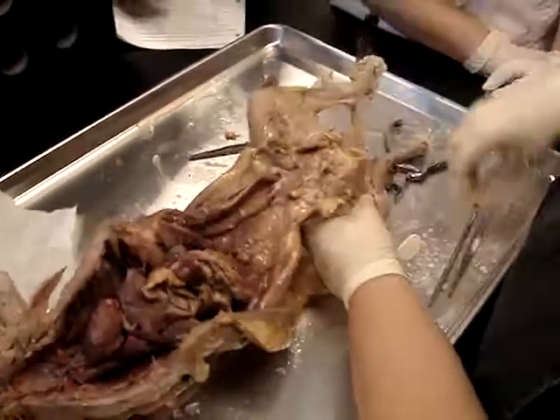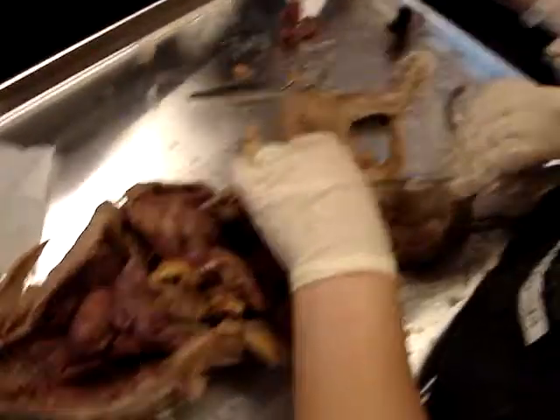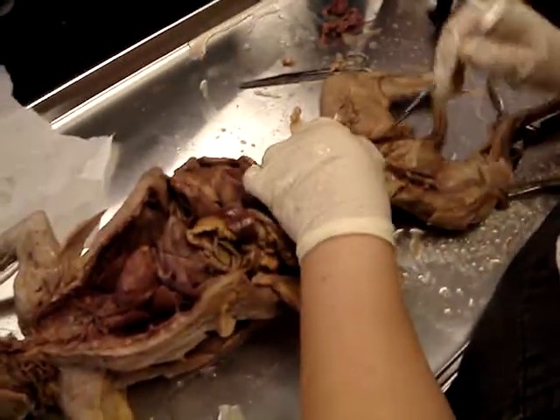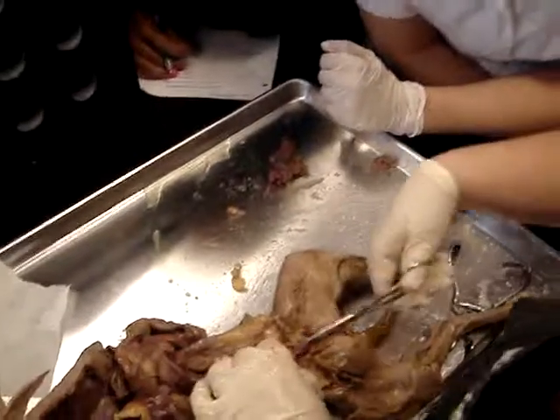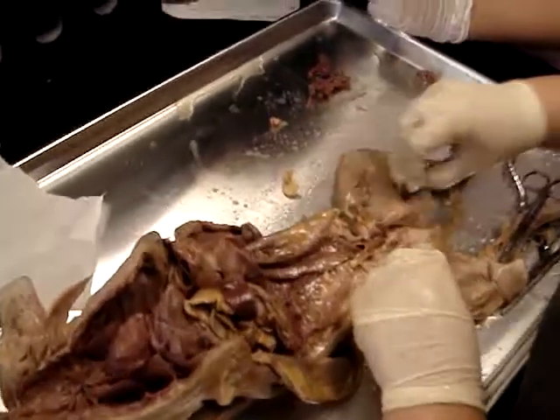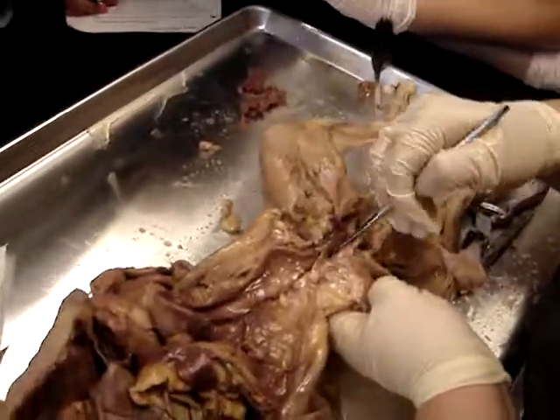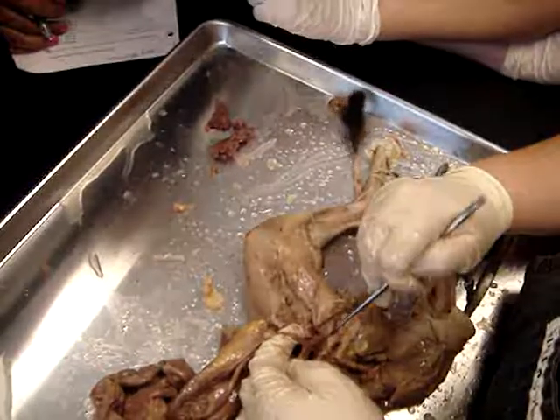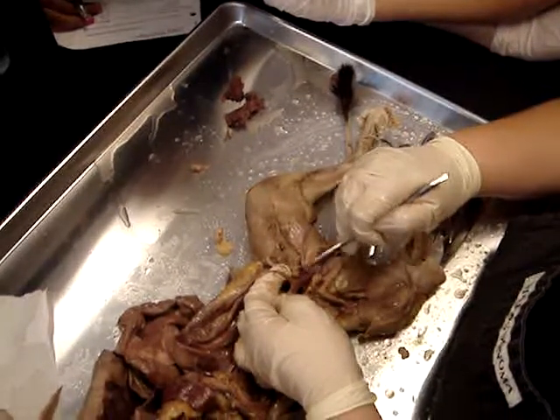All right. Wow. So this is her urinary bladder, right? And here's her urethra. Okay, and if you want to clean out, you can follow it all the way down to the external urethral opening. All right. And then underneath, hold on a second. Let me just get this cleaned up a little bit so I can pull it out of the way. So I'm going to pull her urinary bladder and urethra out of the way. Here's the bottom part of the uterus because it's Y-shaped, right? And then everything else from about here down is the vagina, after the Y.